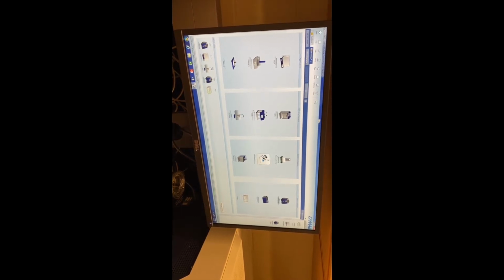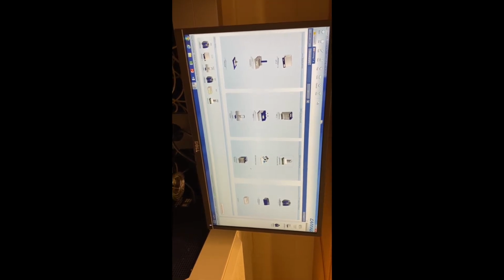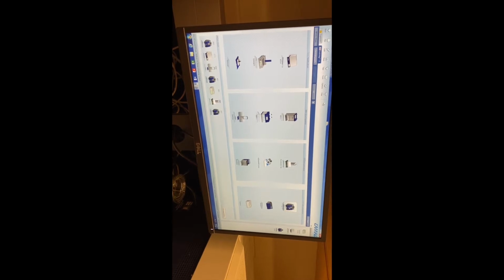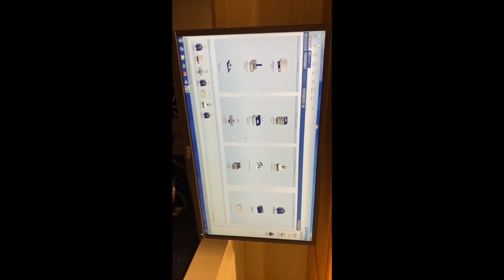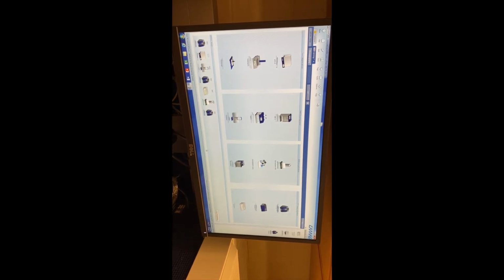And then I have a derivatization step. So, and I'm using a dip. If later on we have a spray or we have a derivatizer, you can choose the instrument that we have, but we have this one for now. And then I will take picture again. So my total steps are those ones, but you can adjust it. You can add more or you can delete those. It's totally based on your own experimental process.